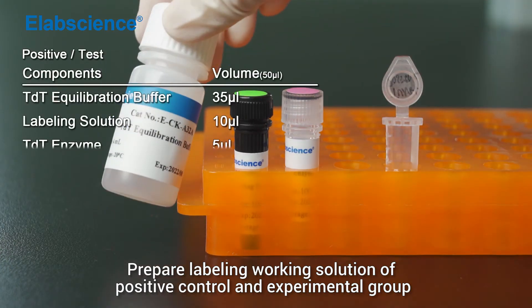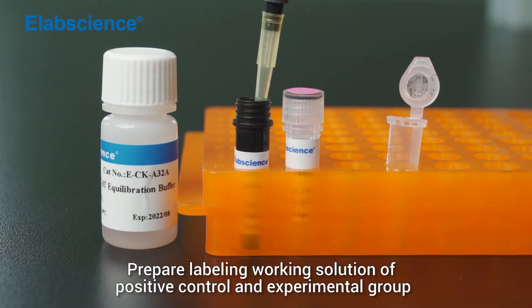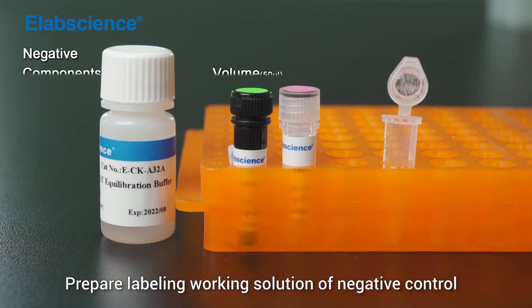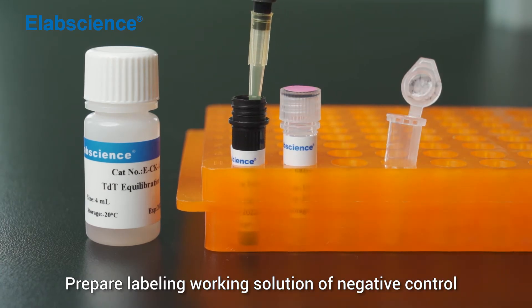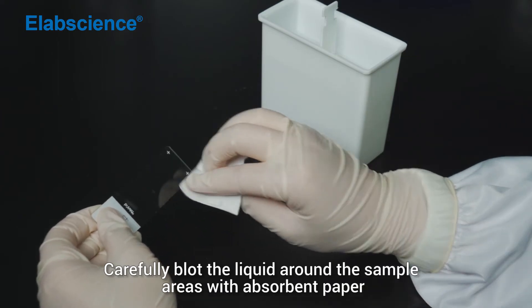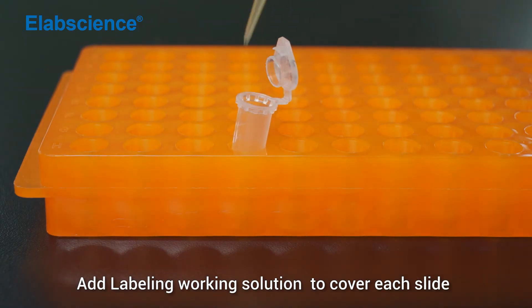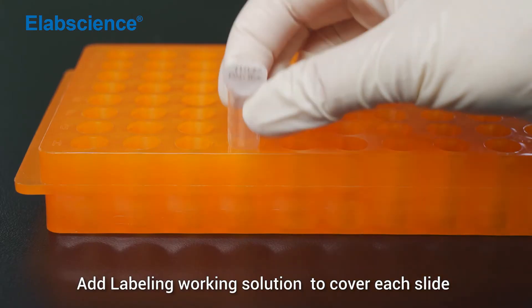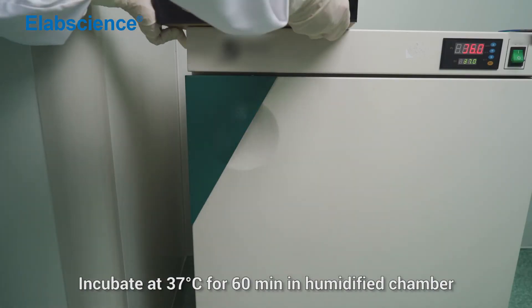Prepare a labelling working solution of positive control and experimental group. Prepare a labelling working solution of negative control. Mix. Carefully blot the liquid around the sample areas with absorbent paper. Add labelling working solution to cover each slide. Incubate at 37 degrees for 60 minutes in a humidified chamber.